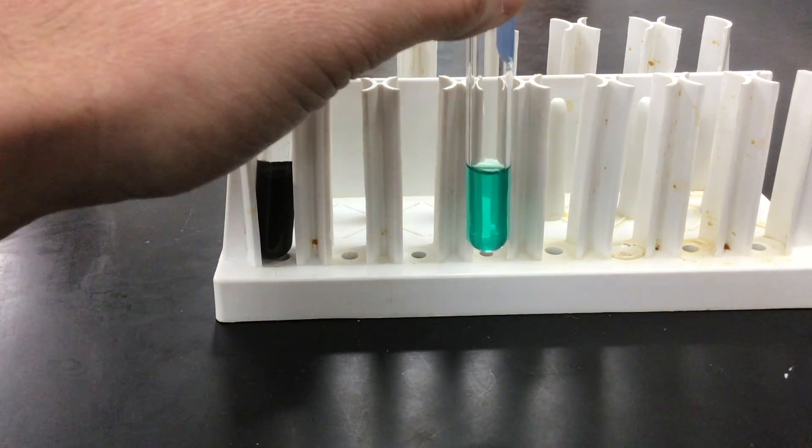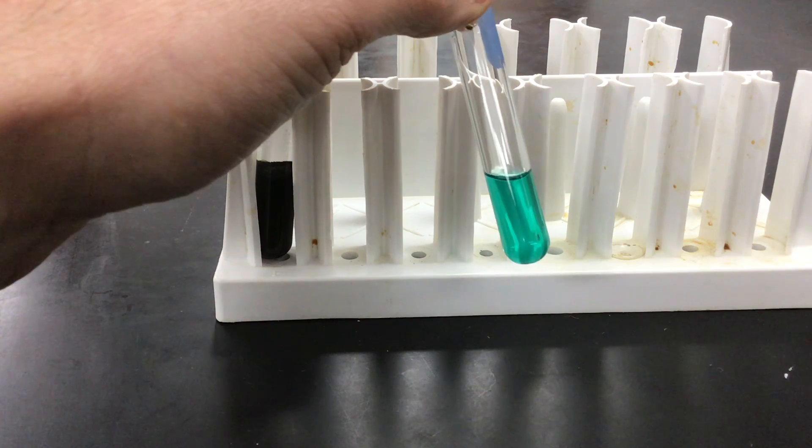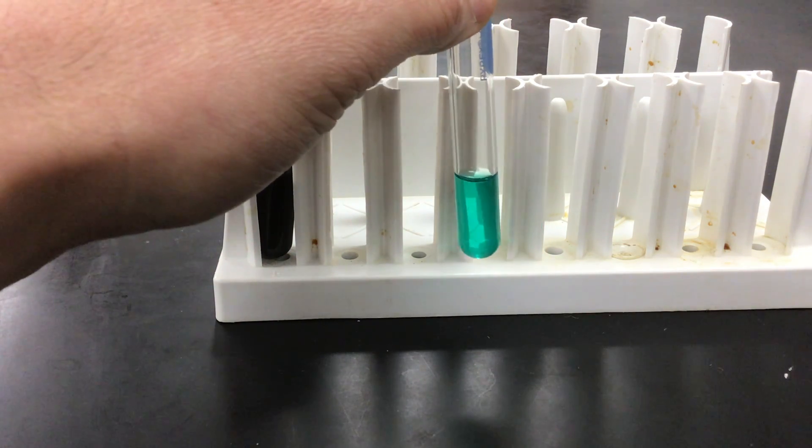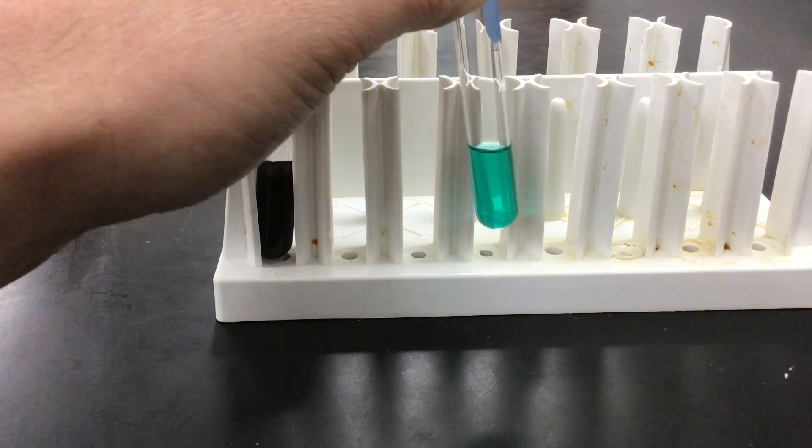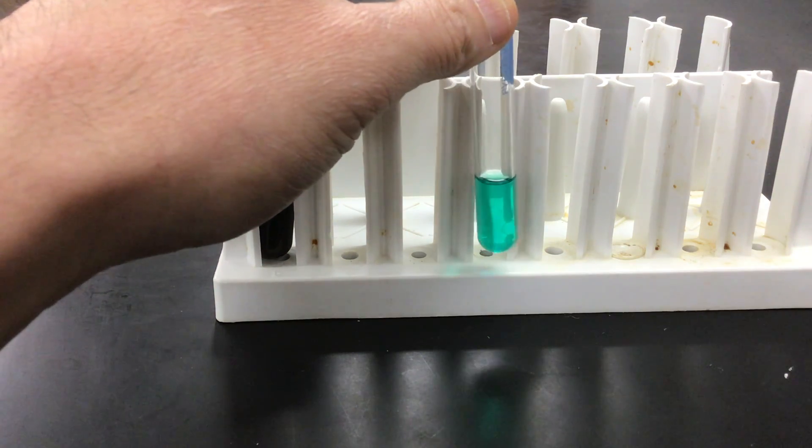So that is the color. You can see it's the color of the solution, along with the fact that you can see through it now. It's not opaque. So that's step four of the copper reaction.